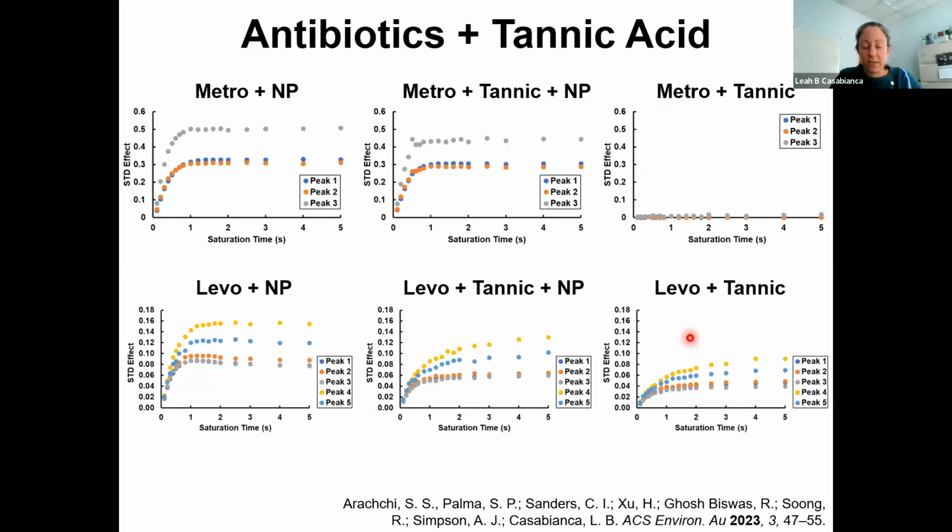effect for the levofloxacin. And this indicates that the tannic acid is perhaps forming aggregates, and the levofloxacin is interacting with these tannic acid aggregates, and this is the saturation transfer that we are seeing. So in this case, we have levofloxacin binding to both tannic acid as well as polystyrene nanoparticles. So the STD buildup curve looks intermediate between the two.